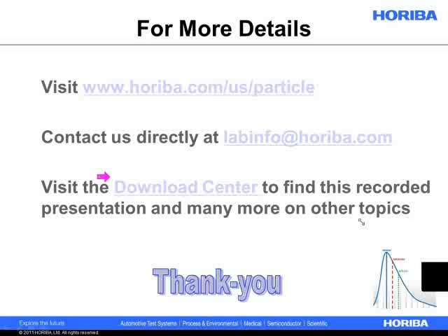Bill's reminding me that sampling errors can be a major factor compared to instrument errors. Thanks, Bill.